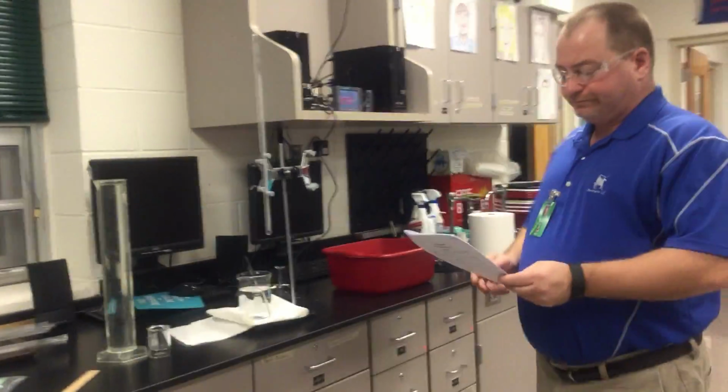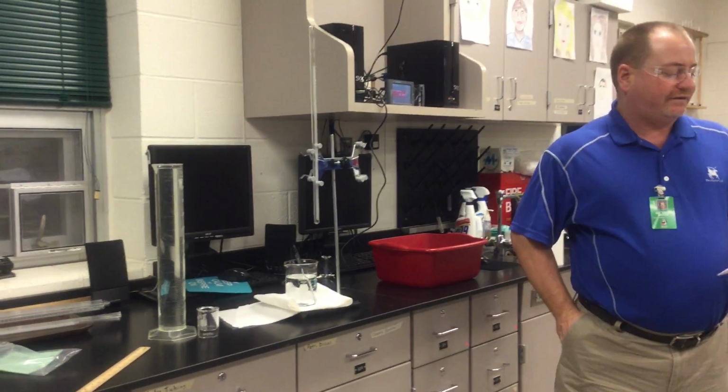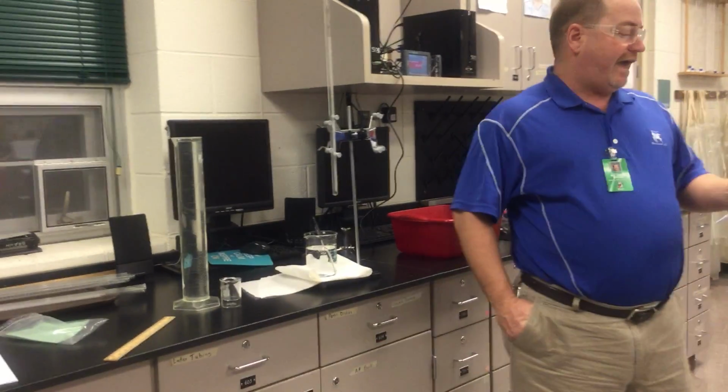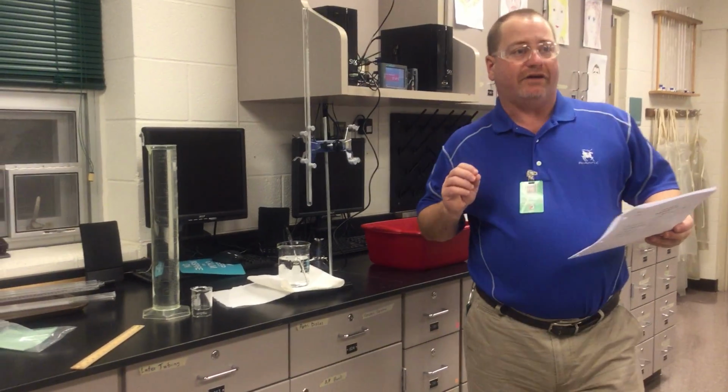All right. Cut a length of magnesium ribbon between 2.0 and 2.5 centimeters. Determine its mass to the nearest 0.0001 grams. Now, we don't have an analytical balance in here that reads that good.